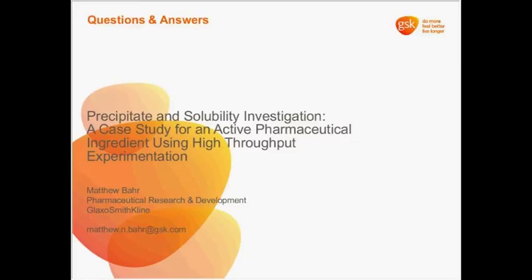Yeah. So what this question's asking basically is, we started our experiments with standard stainless steel stir bars, and then we found that the drug was chelating and everything turned this dark red color, and then we stopped those experiments and moved on to using Teflon coated stir bars for the remainder of our experiments, and this stopped the rust formation.